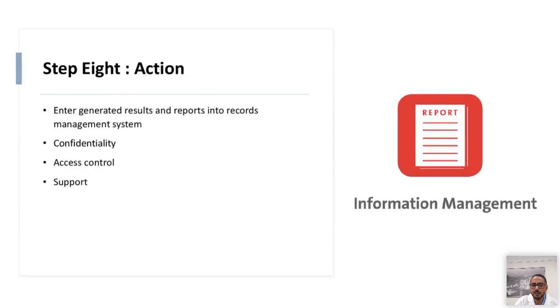Also, another action step is information management. How are the results going to be reported or recorded into the record management system, whether, if you are lucky enough, it's a computer information system, or even if it's paper-based documentation? You would need to consider the confidentiality of those documents, who has access to them, and what kind of support is needed in case there is a lab information system there.